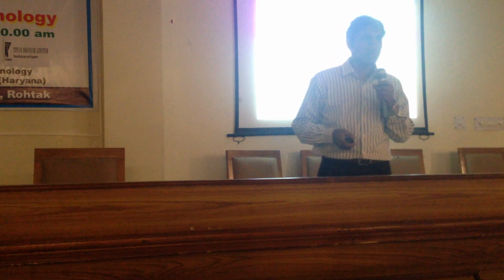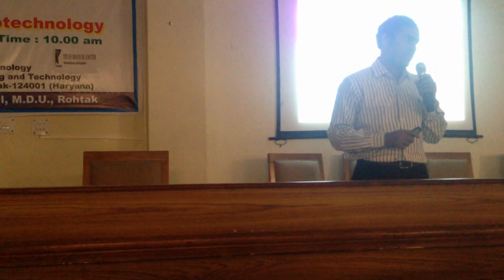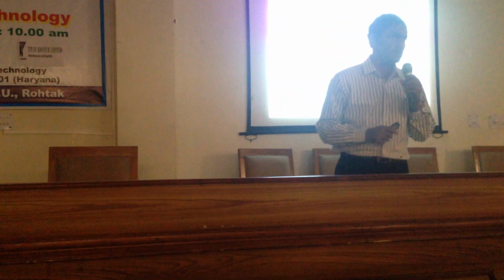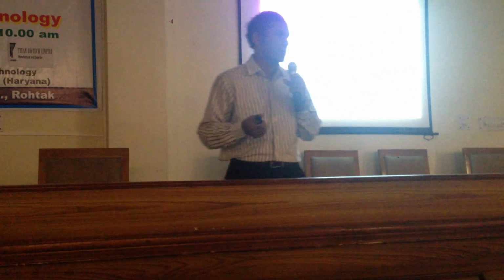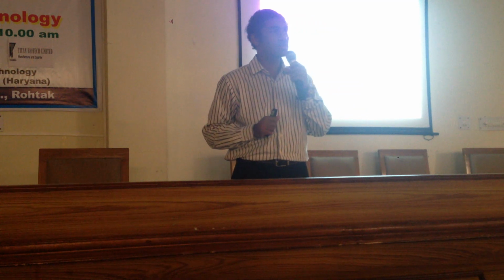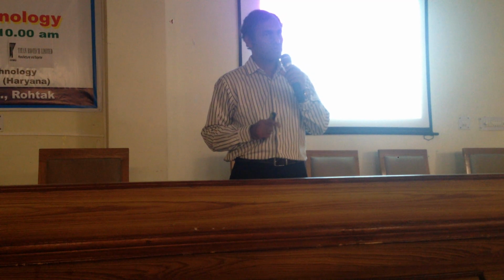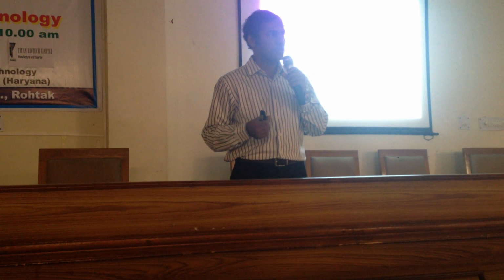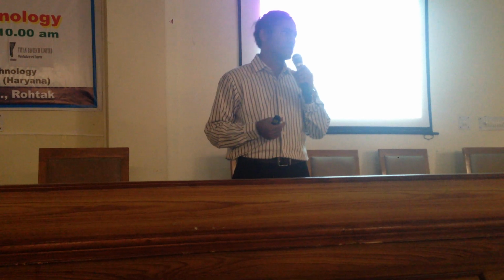There's another technology which is owned by Life Technologies. It's a big name in life sciences. Life Technologies is a company which has done a lot of work on next generation sequencing technologies. And the third technology which I'm talking about is also owned by Life Technologies, and that is called SOLiD sequencing.